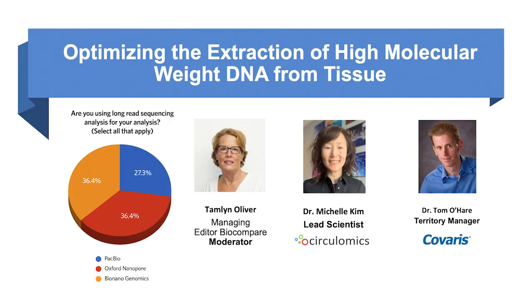Good. All right, we'll go on to the fourth and final polling question before our Q&A. And this one is, are you using long-read sequencing analysis for your analysis? PacBio, Oxford Nanopore, Bionano Genomics. All right, I'm going to give you a second to answer that.